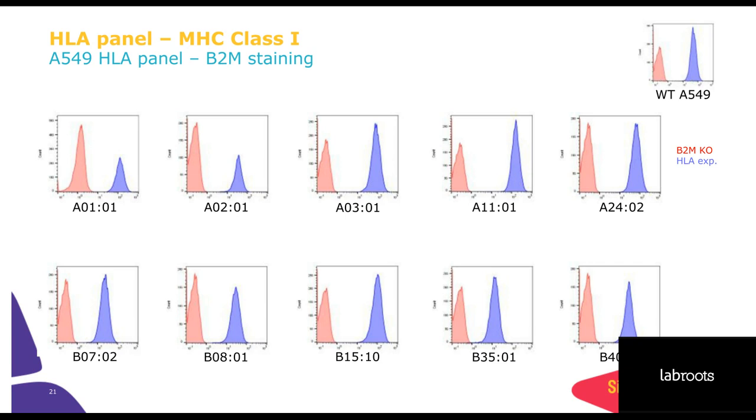And we have also done internal testing looking for whether any of the endogenous HLAs are pulled to the surface once we overexpress these HLAs. However, with our lentiviral construction, we have fused beta-2M to each of these HLA types, so we only see the fusion protein product on the surface. We don't see any of the endogenous HLAs, but we have carefully looked for each of these panels.